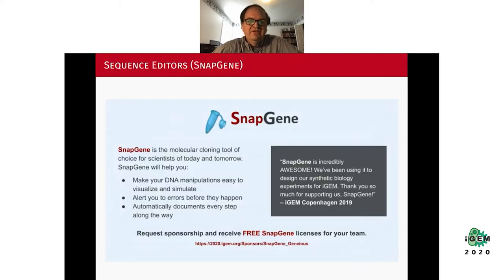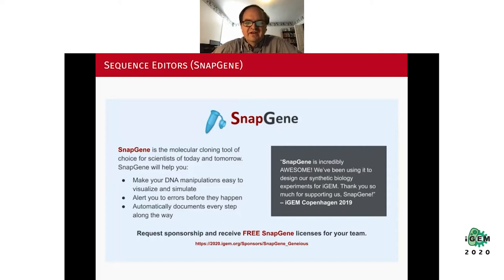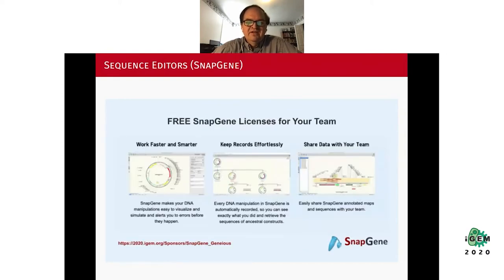Another very useful sequence editor available to iGEM students is Snapgene, a molecular cloning tool that allows you to do DNA manipulations, alert you for errors, and step you through your entire genetic design. You can get free Snapgene licenses for your team. There are a lot of useful features especially for visualizing your genetic designs within Snapgene.